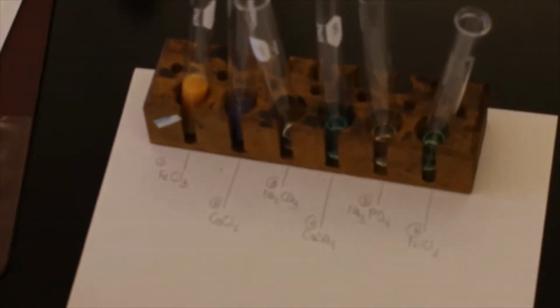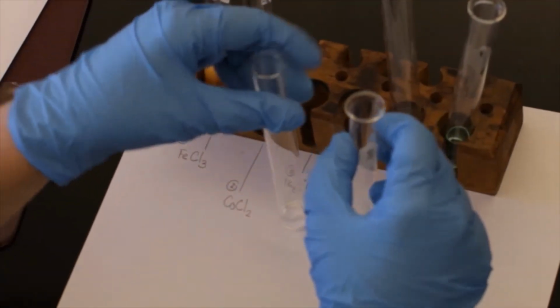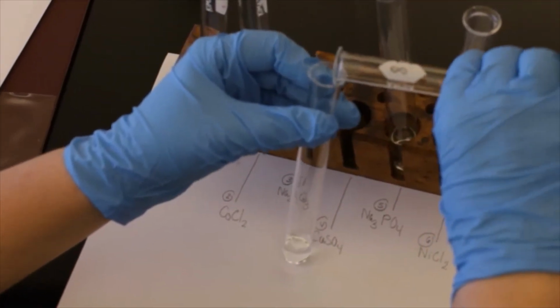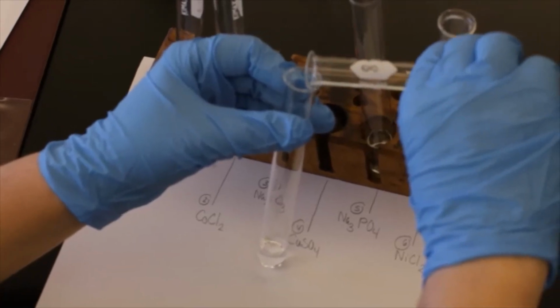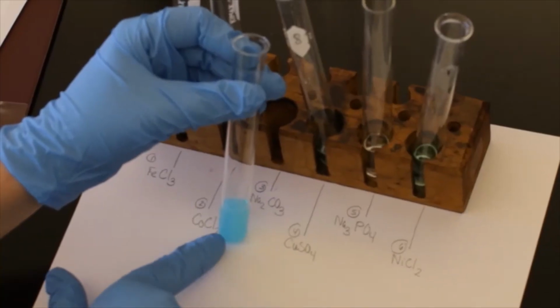Purple with a solid. Now if we're doing number C, or letter C, we're going to transfer half of solution 4 into test tube 3. So now we're mixing Na2CO3 with CuSO4. So we're going to pour half of this into here and see what happens. So we'll pour in. And here we went from clear to a bright blue.